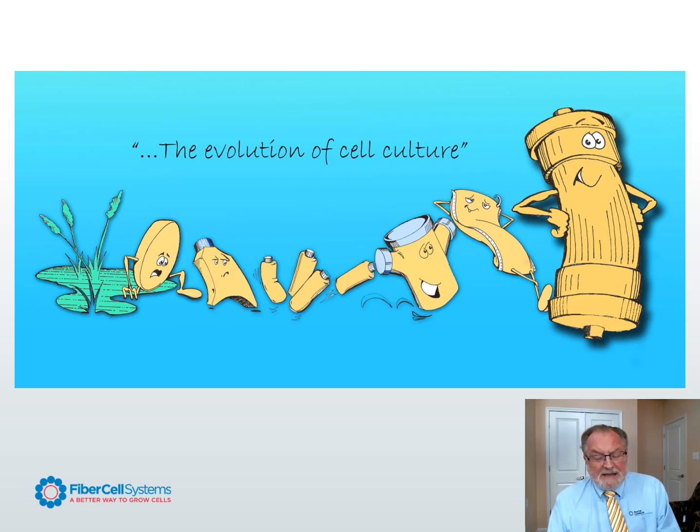After starting with the 3D culture of Harrison and his plasma clots, cell culture then lost some of its physiological relevance through the use of 2D plastic flasks and fetal bovine serum. 3D hollow fiber bioreactors have evolved to be a more in vivo-like way to culture cells and provide the opportunity to more closely recapitulate complex biological processes.